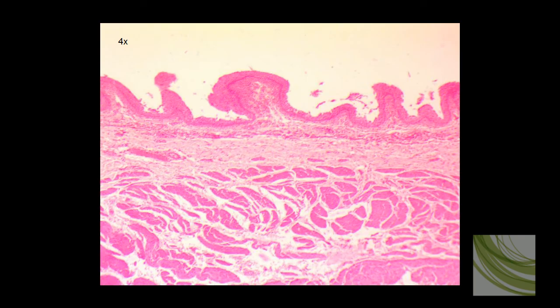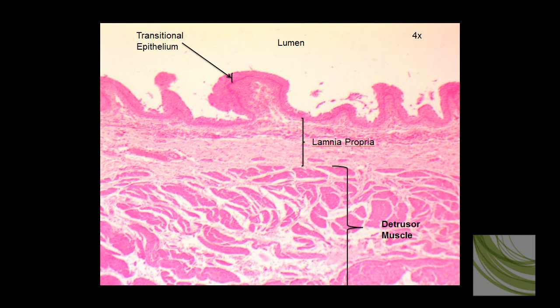Here is our second slide of transitional epithelial tissue, and we can see a lot of different tissues here. This is another urinary bladder, and we're using the 4X objective. We can see the band of transitional epithelium. The dark line is the basement membrane. There's the lamina propria. Then we get down into the detrusor muscles and the lumen. Remember, epithelial tissue is always found on the edge of a tissue.